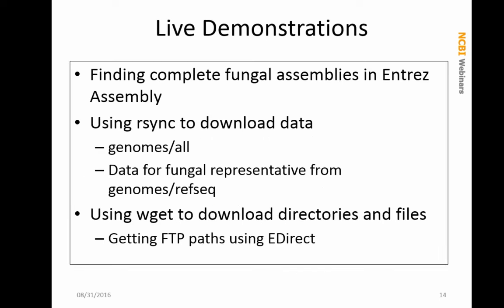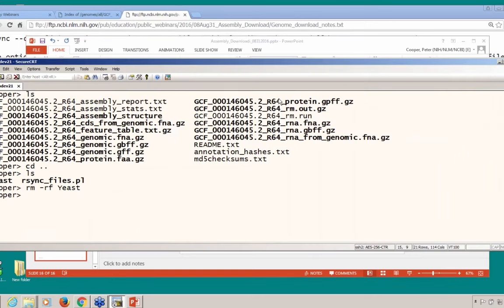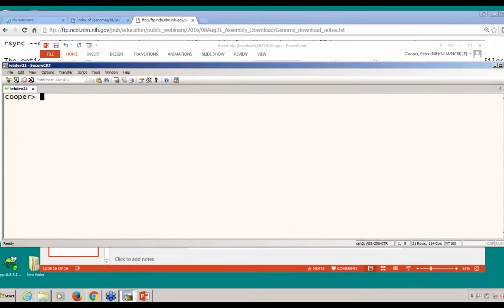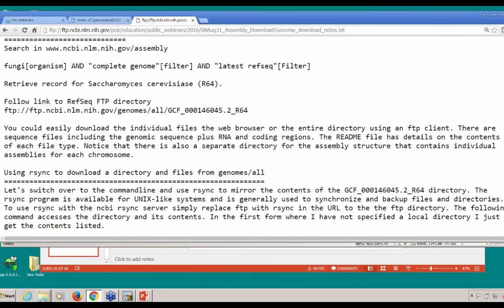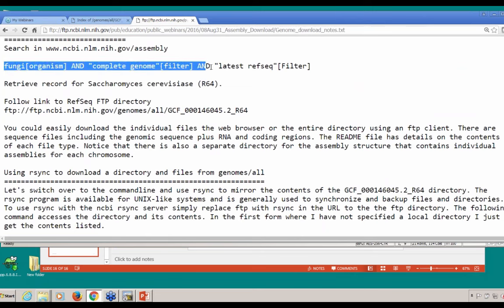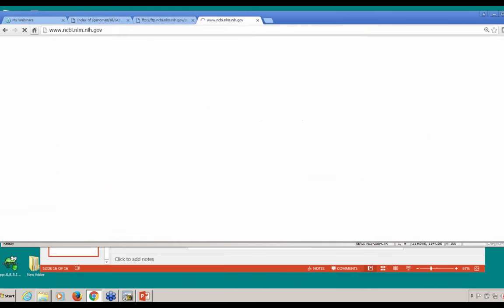We are going to work with getting fungal assemblies. I will show you how to use rsync to download data and how to use wget to download directories and files. Let me pull up a command prompt — you should be seeing a command prompt here on one of the servers at NCBI. On our FTP site there is a list of commands we are going to be going through as the demo. One of the first things I want to do is use the Assembly resource to get a particular path to a genome.